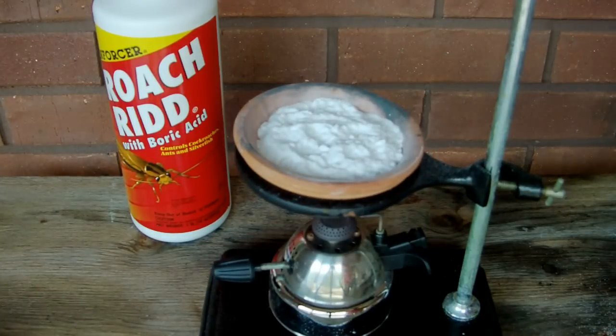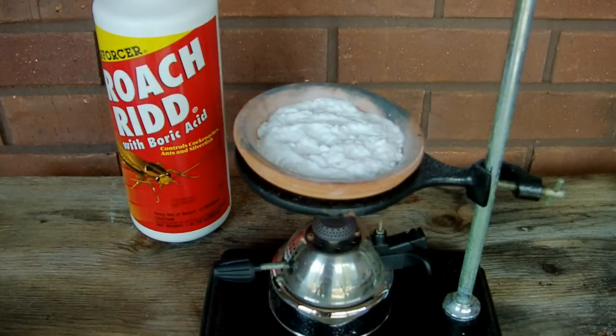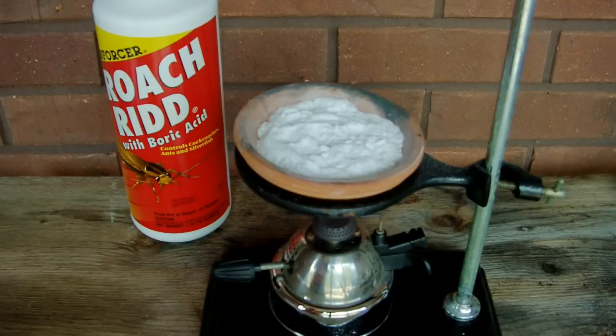In today's video, we're going to be making elemental boron, starting with boric acid. You can also start with borax if you have that instead, but that requires the additional step of adding the borax to hydrochloric acid to precipitate boric acid while leaving sodium chloride in solution.